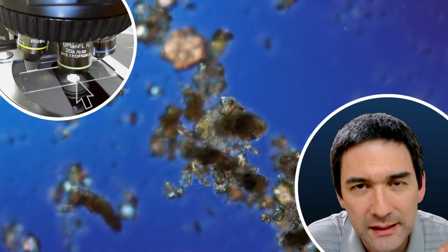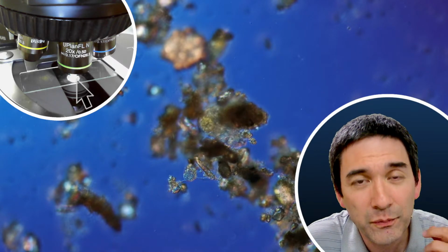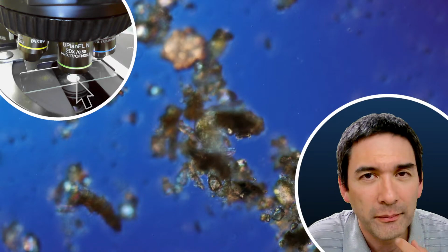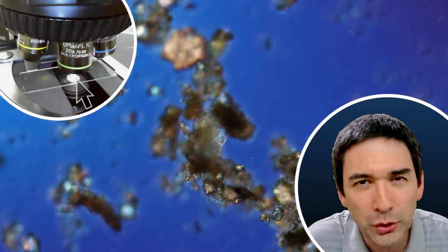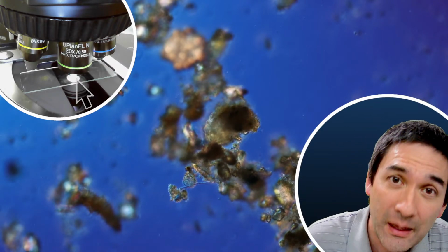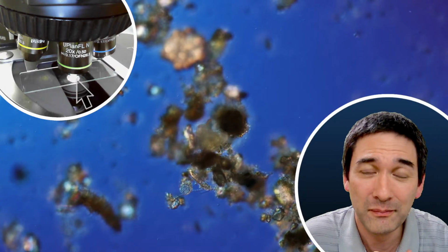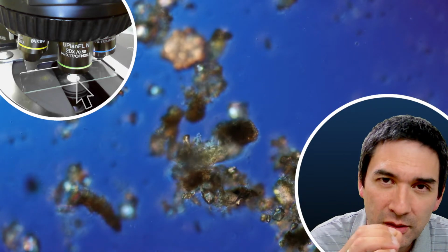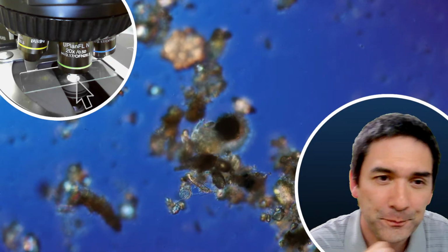In most cases, you won't be able to see the dust because it's out of focus. One of the most problematic places for dust is directly on the camera sensor, because that is where it really casts a very strong shadow and makes a strong speck.